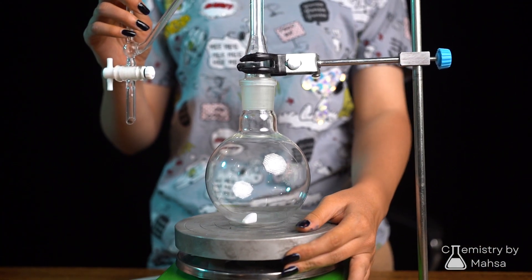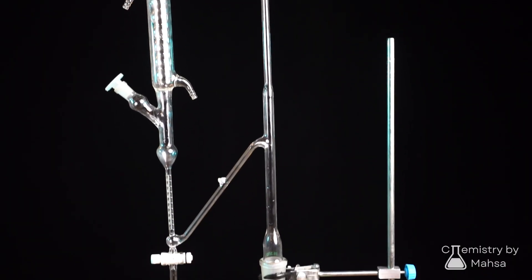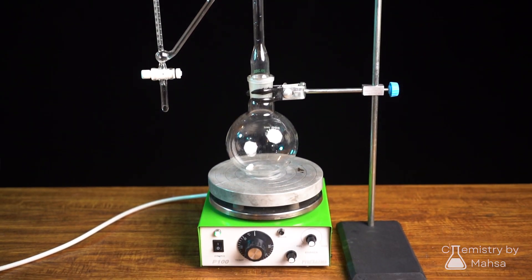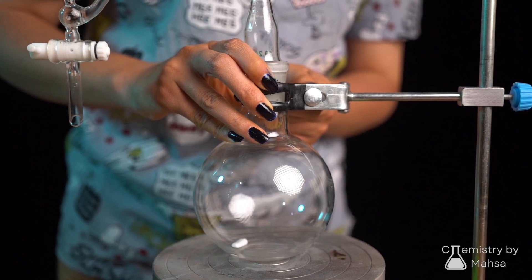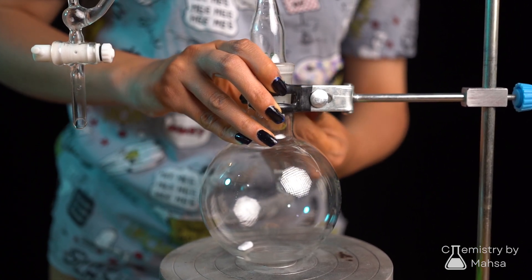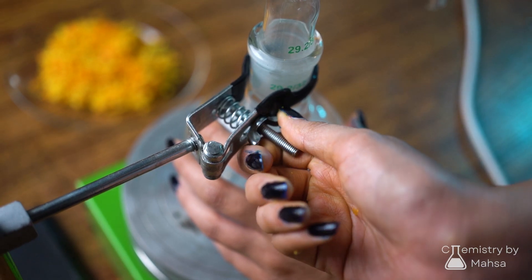There are different methods and equipment, but today I chose to use my Clevenger apparatus. Clevenger is commonly used to extract volatile substances like essential oils, so here we go today.